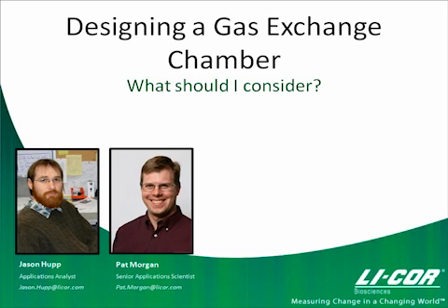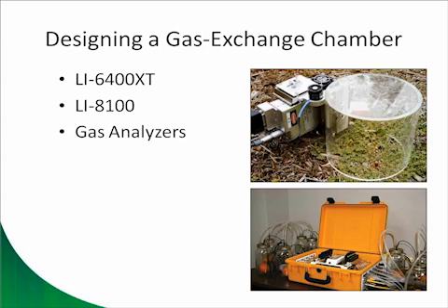As Ashley said, today's webinar is entitled Designing a Gas Exchange Chamber. And today's topics are really going to focus on design considerations, not so much the actual how-to of building a chamber. The information will be really practical to those designing custom chambers for use with the LI-6400 XT portable photosynthesis system, or those designing custom chambers for use with the LI-8100 soil CO2 flux system, or those designing custom gas exchange systems around any of LI-COR's standalone gas analyzers.